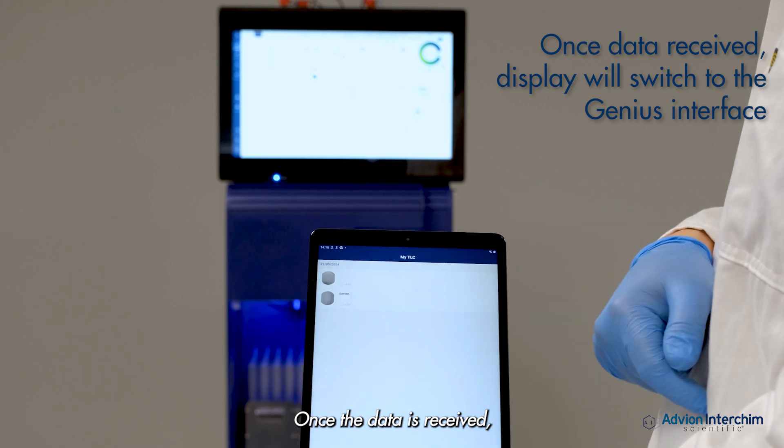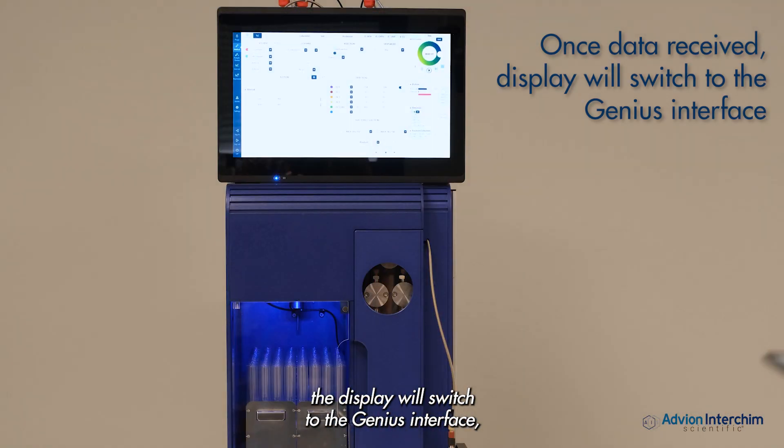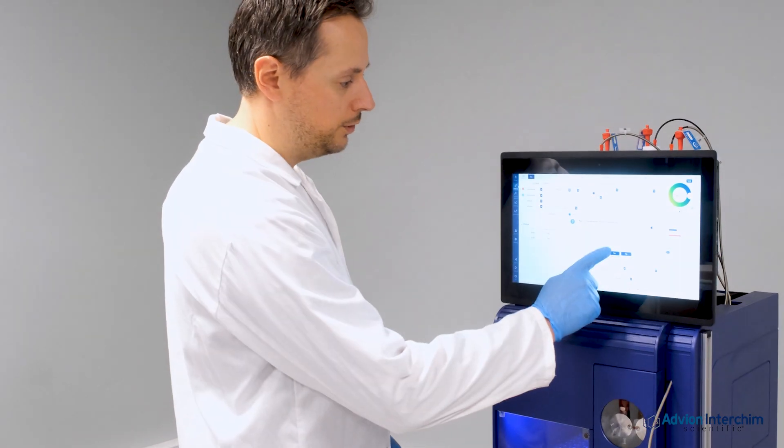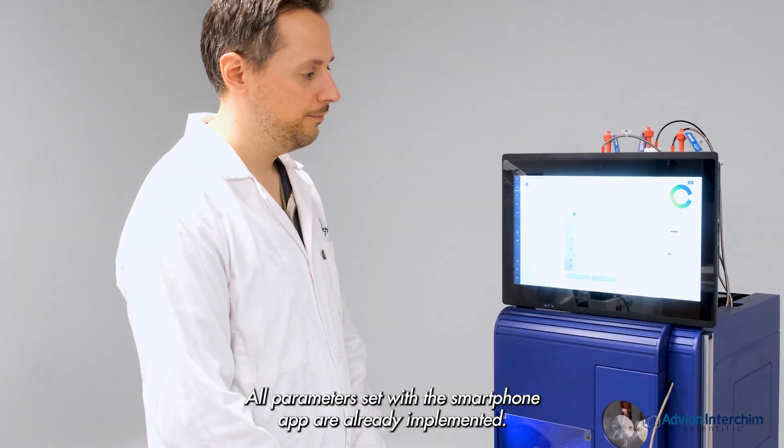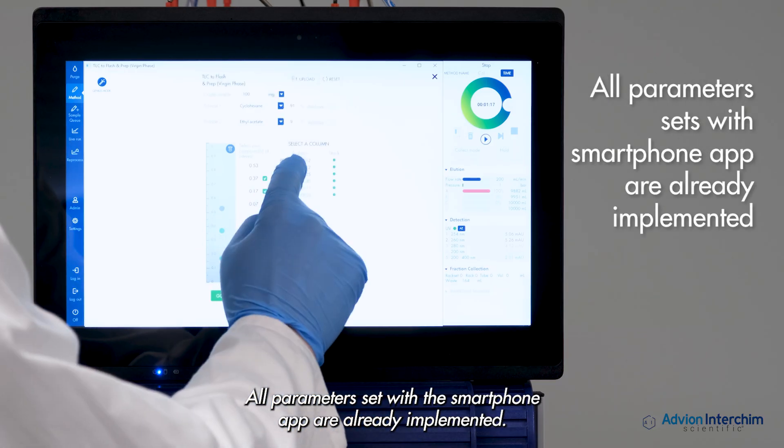Once the data is received, the display will switch to the Genius interface. All parameters set with the smartphone app are already implemented.